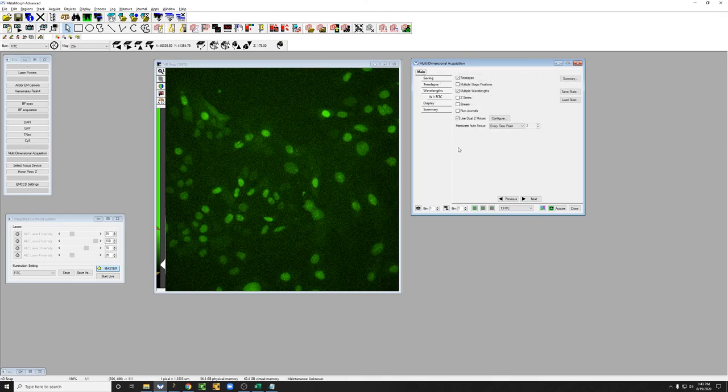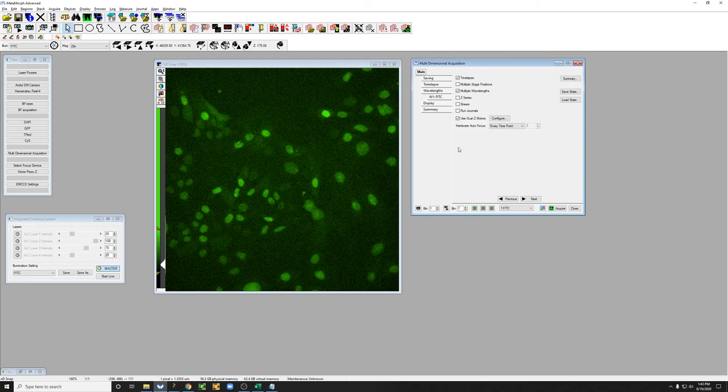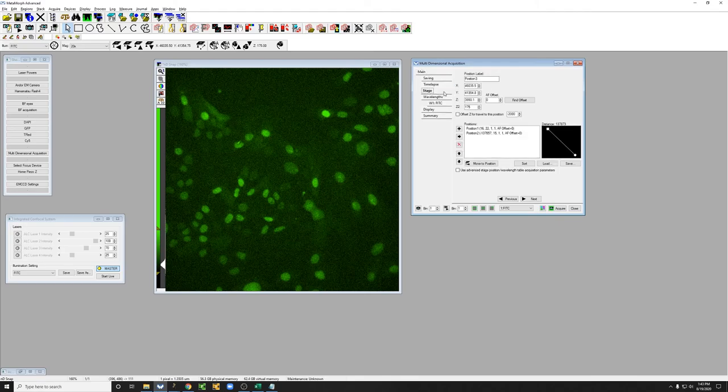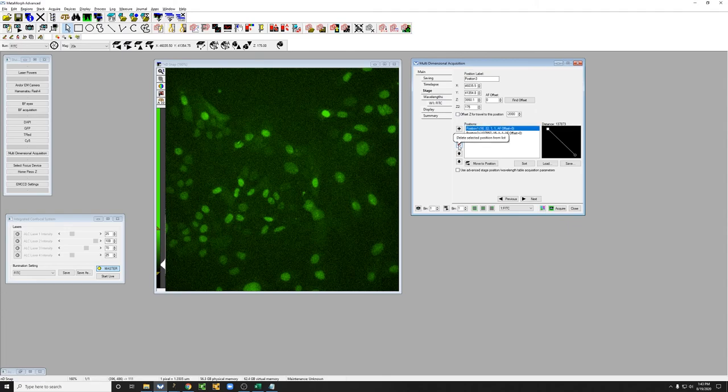Now for this autofocus to work properly you actually have to have at least one stage position, because that is how you tell the autofocus what its reference point should be. So we're going to click on this which says multiple stage positions. Go here and just delete all of the stage positions by clicking on the first one and then clicking on this X until we get rid of all of them.